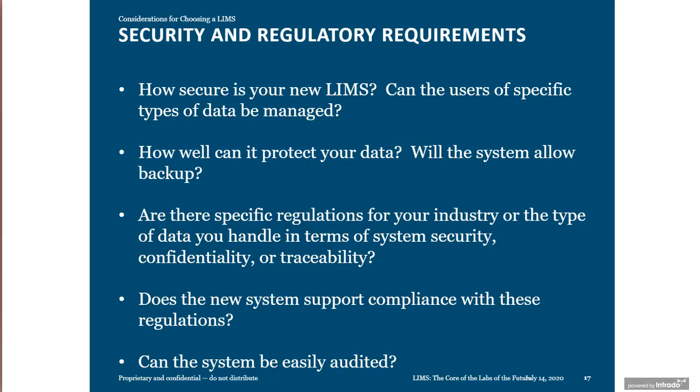And also, another consideration is security and regulatory requirements. How secure is this new LIMS? Can users be assigned roles and data be segregated based on those roles or those sites? Can I prevent certain sites from seeing information that they don't need to see?